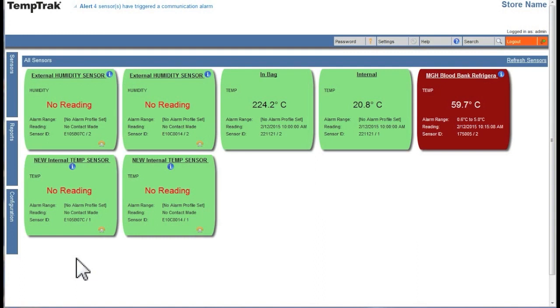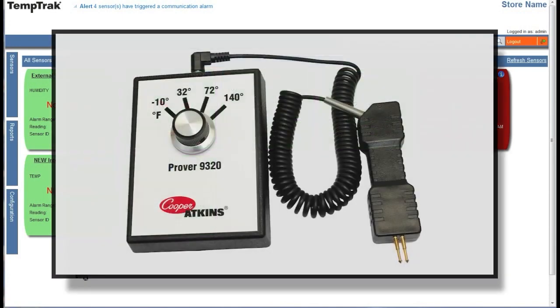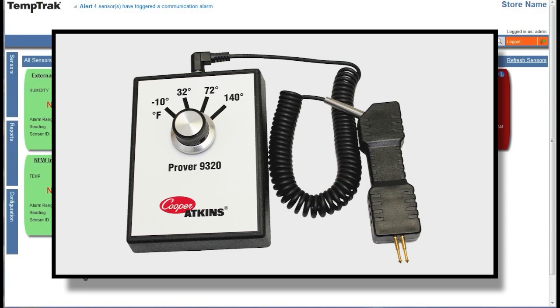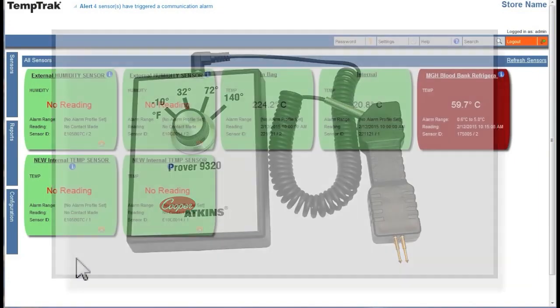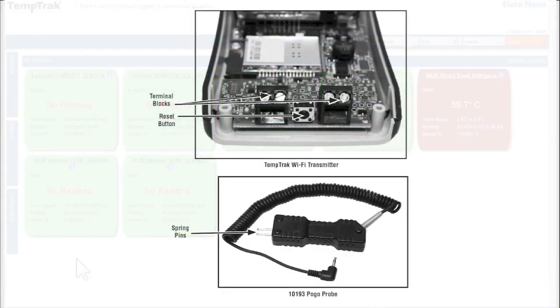In order to perform a NIST validation session, you will need to have a Cooper-Atkins NIST Prover box. This device comes with four preset temperatures, either in Fahrenheit or Celsius, and a Pogo probe that connects the Prover box to the transmitter terminal block.